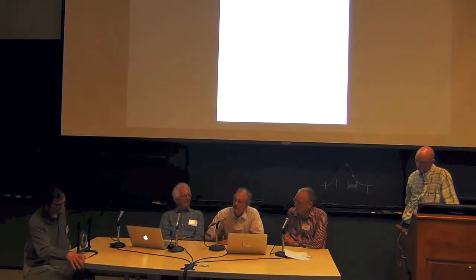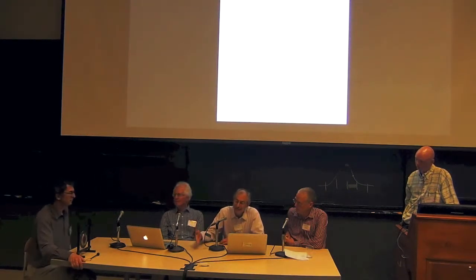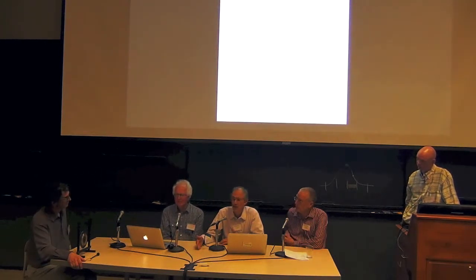From the data shown there, and interleukin 1 beta is an example of this as well, at low resolution, say the space group was P4 sub 1 2 2, but at higher resolution these 2-folds broke down, and it became P4 sub 1, and then added onto that with some twinning and so on. So in this case, from the table 1, I think you could not unambiguously agree with the authors what the space group was, in fact.